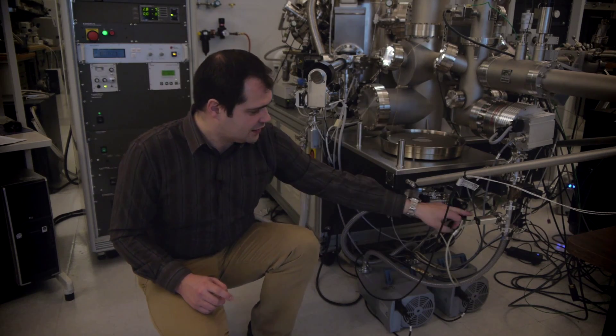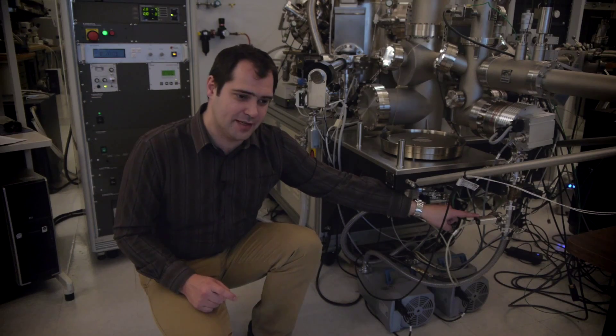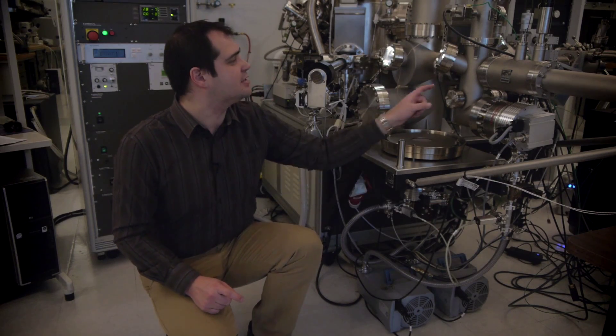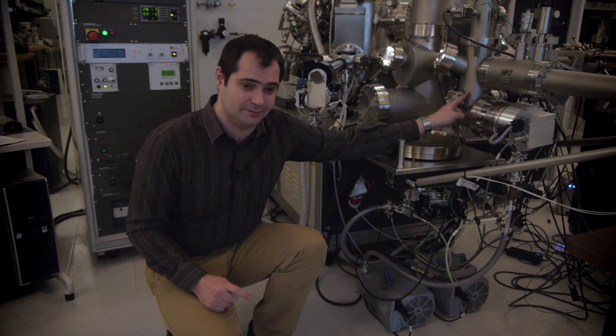We measure pressure at various stages. Here we have a Pirani gauge for measuring our rough pressure, and on the other side of this chamber we have a cold cathode gauge for measuring our high vacuum pressure, or even ultra-high vacuum pressure.